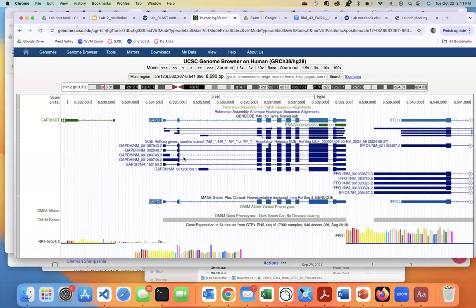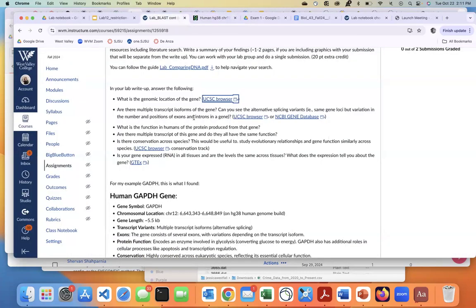These all have a relatively similar number of exons, but this is how you know if it has an isoform, because you will actually see it here. So this does have different isoforms, but they're not that different from one another. Sometimes you'll see they actually are pretty different, and the different isoforms can have totally different functions from one another, even though they're technically the same gene locus.